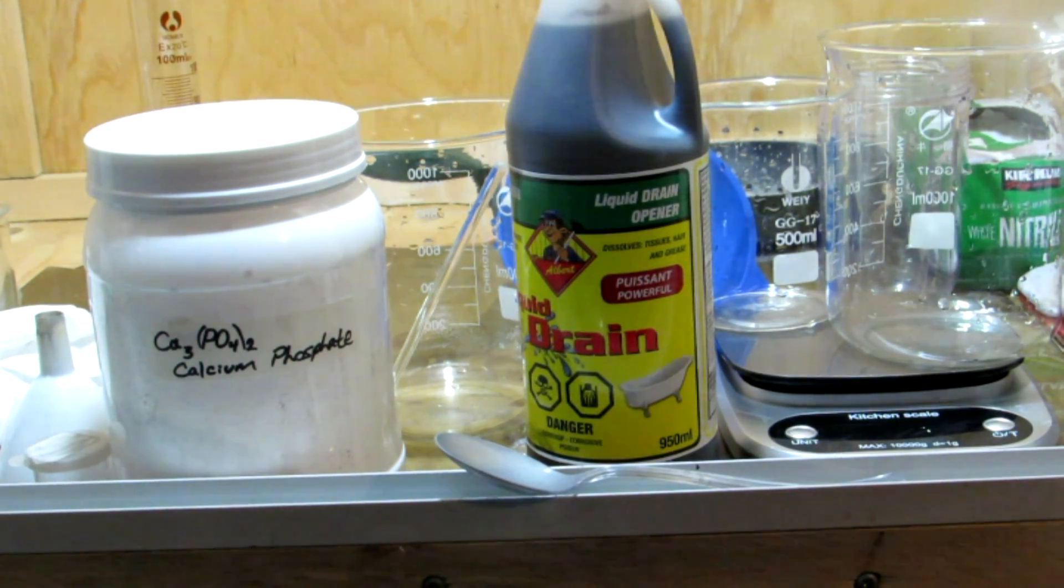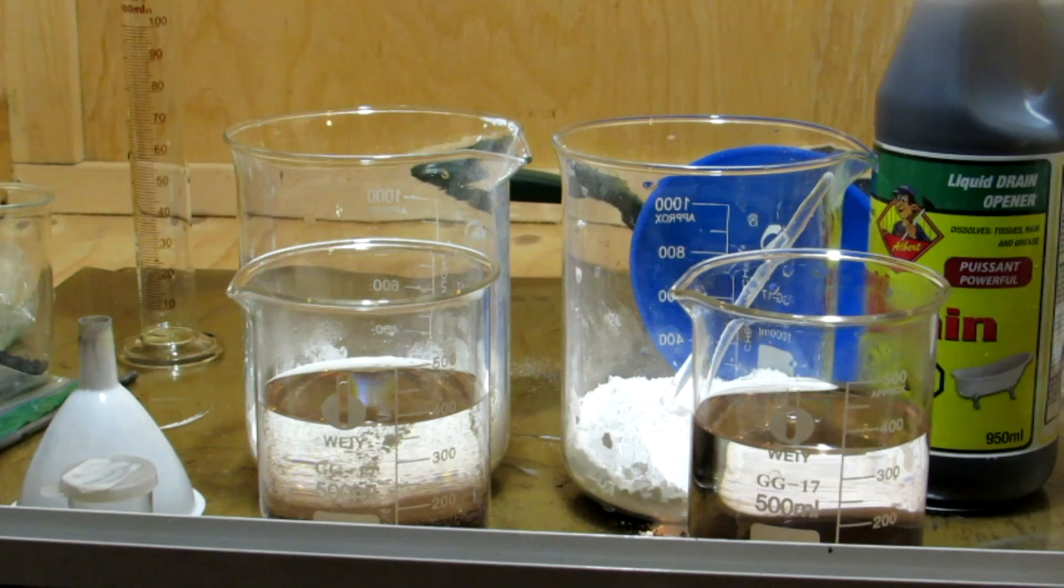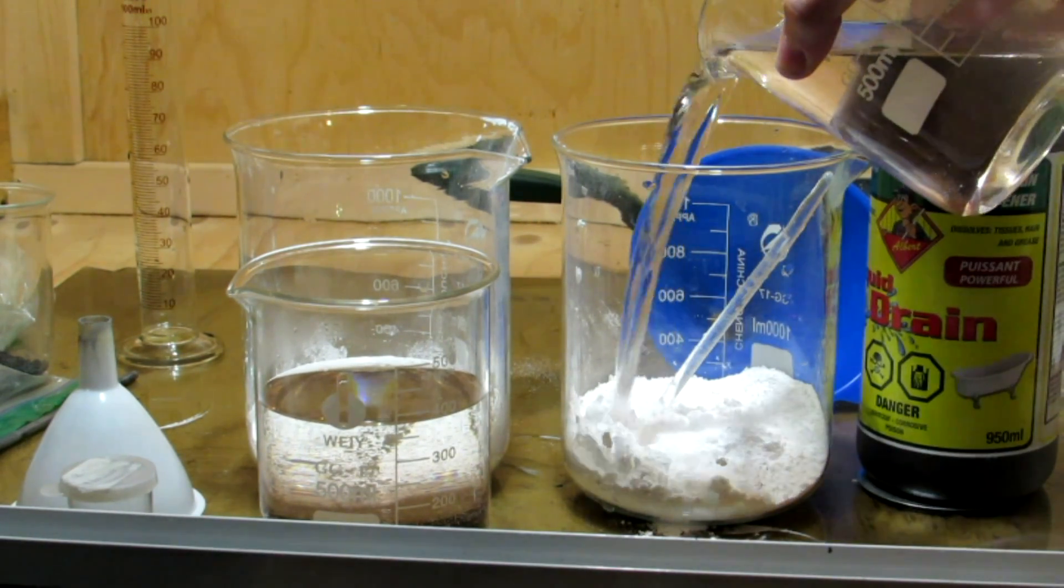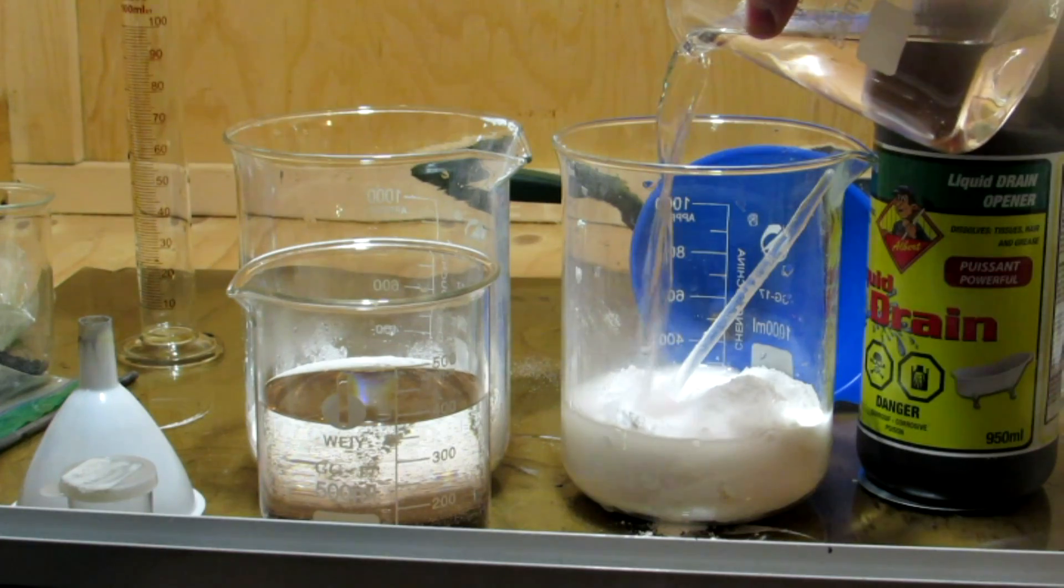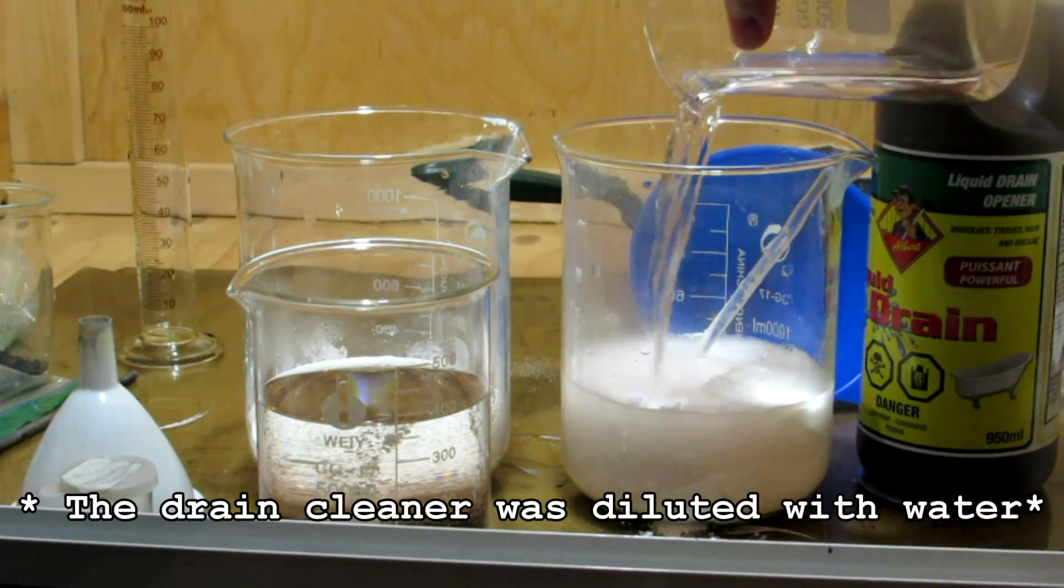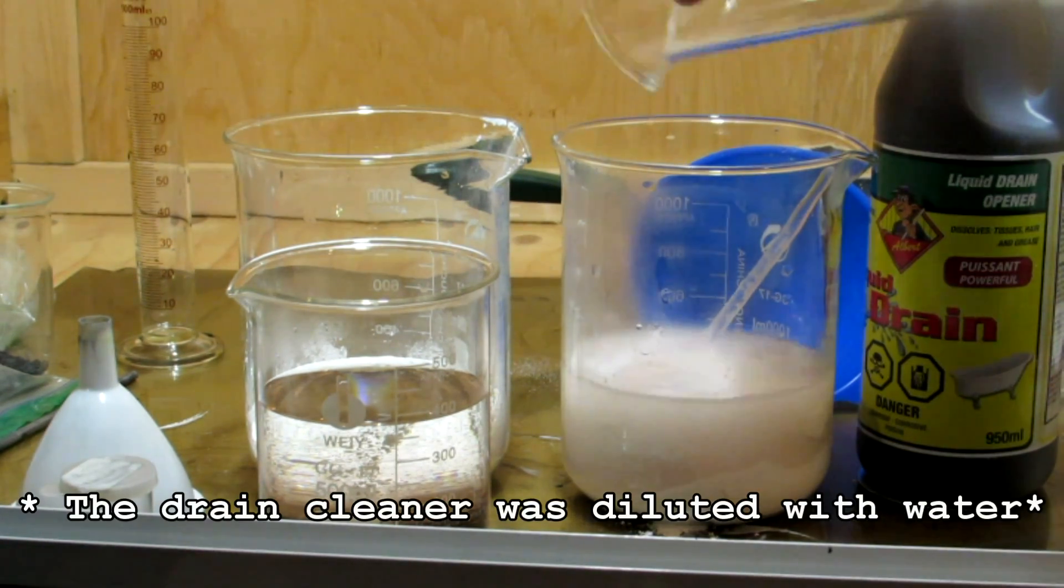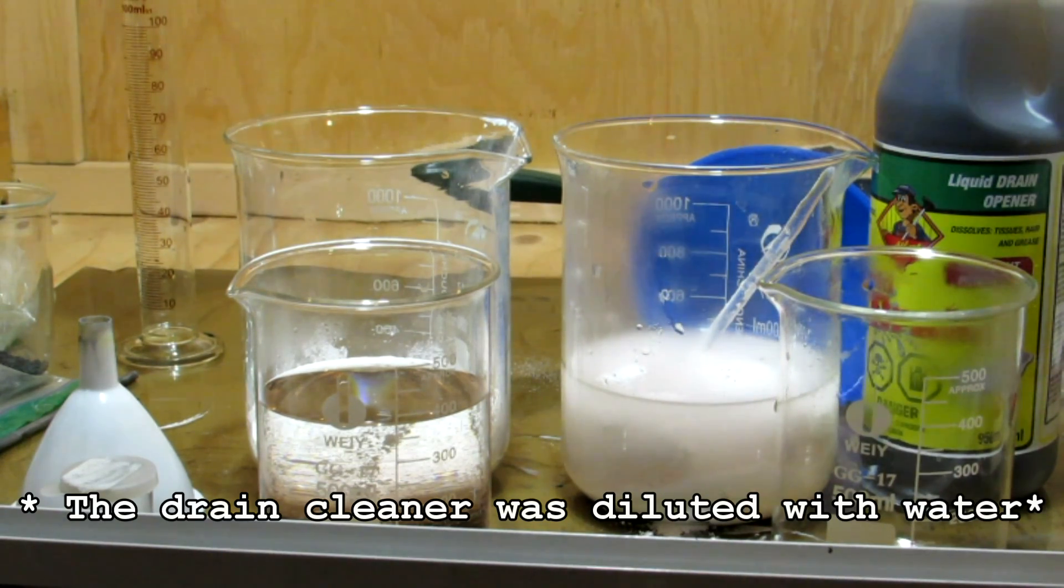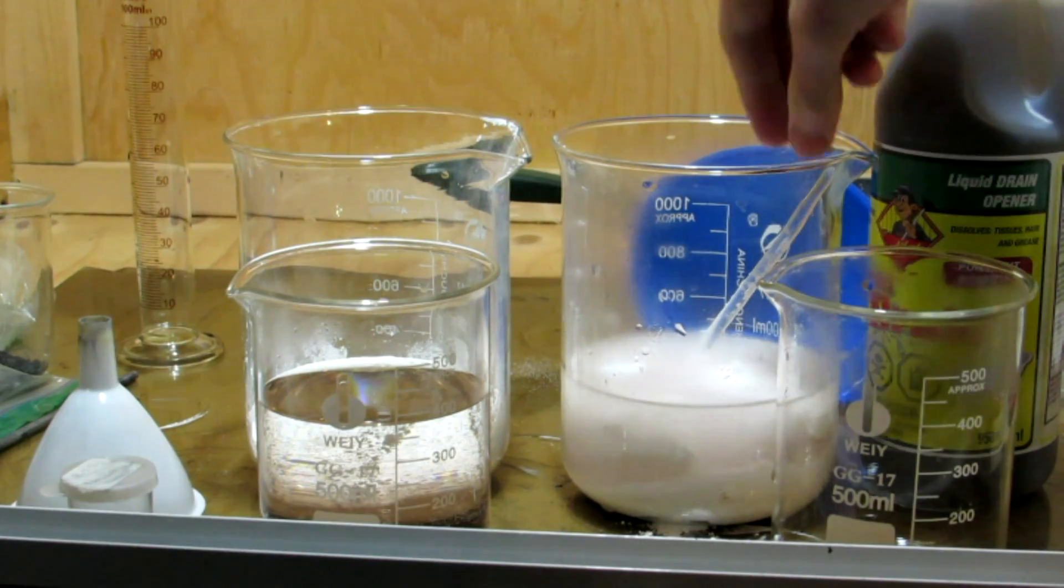To begin, I split this up into two batches, but we need 250 grams of calcium phosphate, so I put 125 grams per beaker. Next we'll need about 66.6 milliliters of 93 percent drain cleaner. As I mentioned, I got this from Rona.